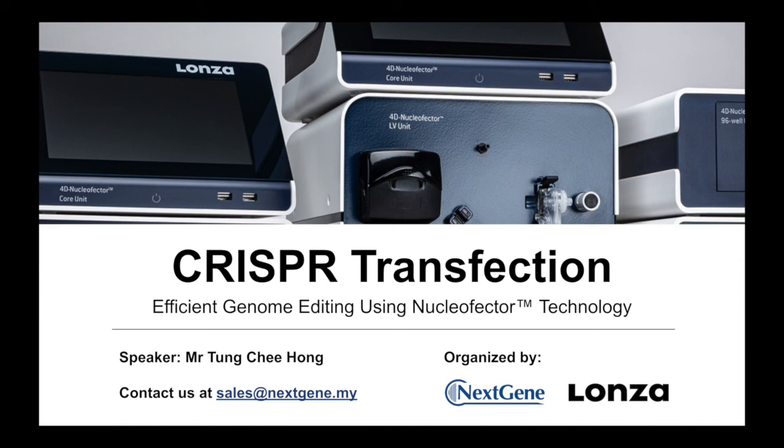Actually, I'm not really familiar with the Cas12 protein, but if I'm not mistaken, it should work quite similarly to Cas9, because it only differs in sequence and also the PAM sequence. So if you're using the RNP method, it should work quite similarly.